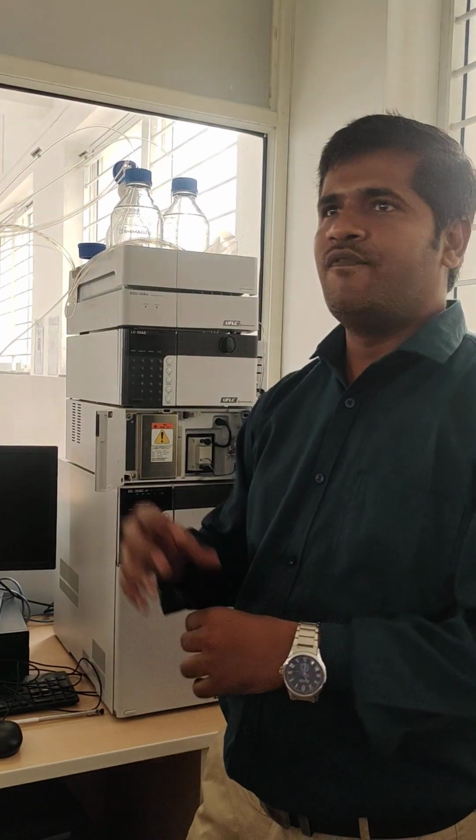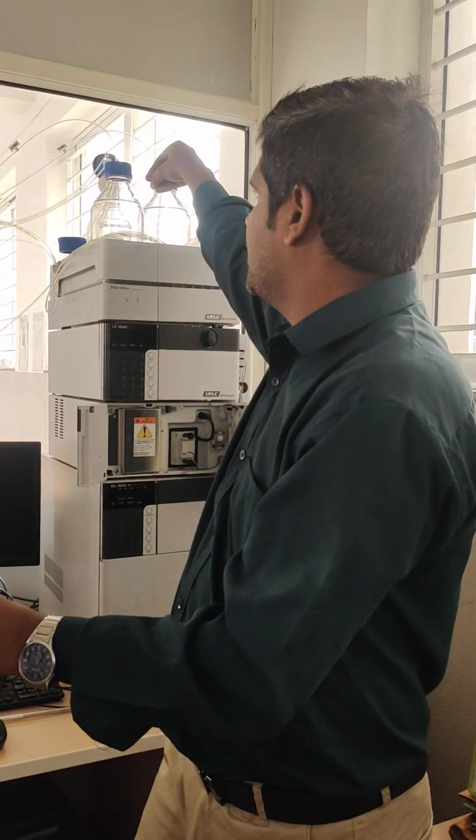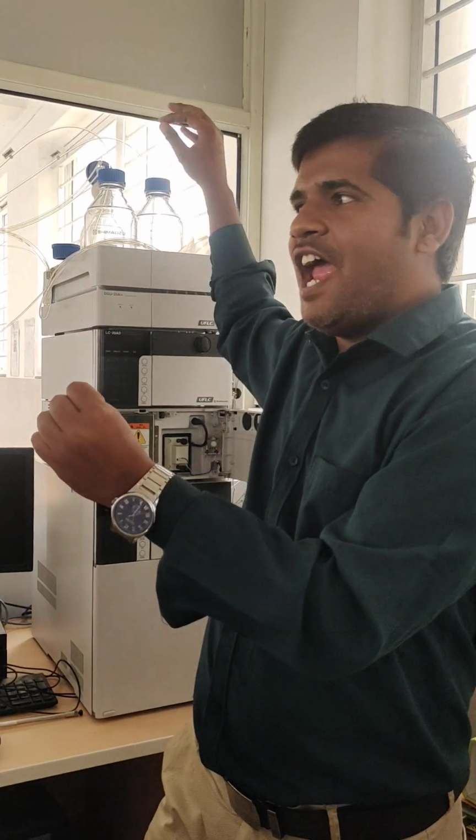Suppose we don't know the retention time where we get the peak, and we have used only an isocratic system, like methanol:water 50:50, kept in one bottle, bottle A only. The composition is single, 50:50, and we analyzed the sample but didn't get a result.